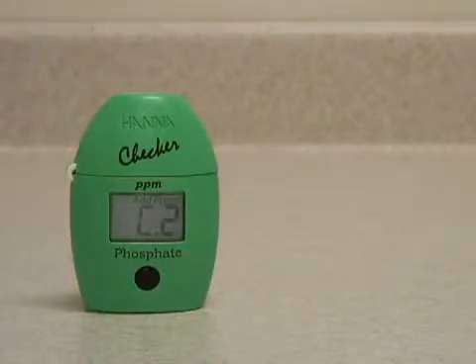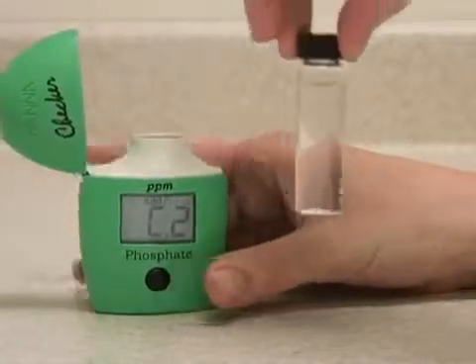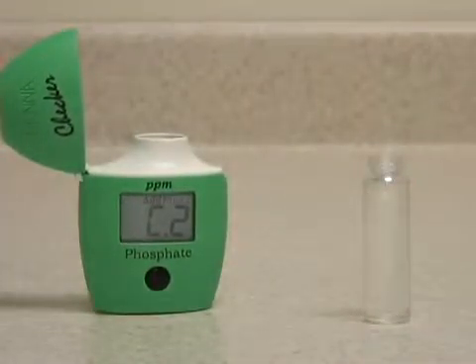When the meter displays C2, you want to add your reagent to this same vial. Try to avoid touching it with your fingers in the middle, as you'll put fingerprints on it that could alter the reading.